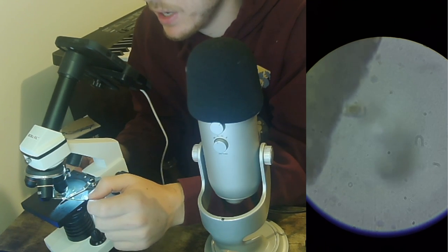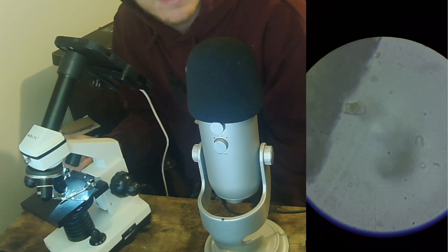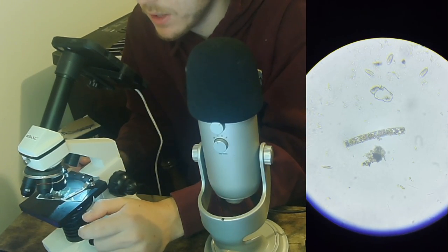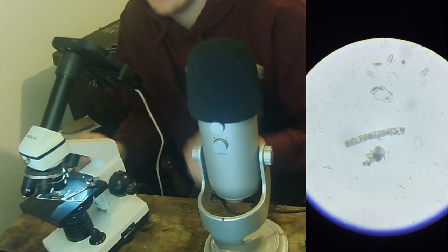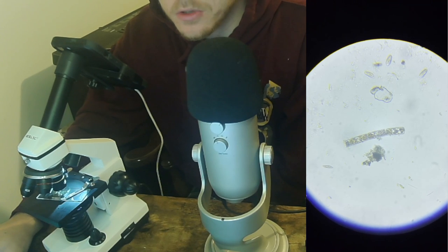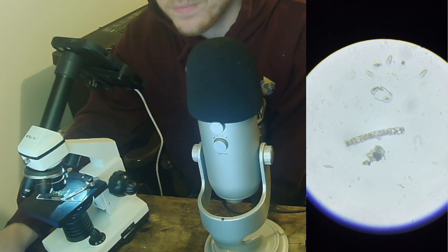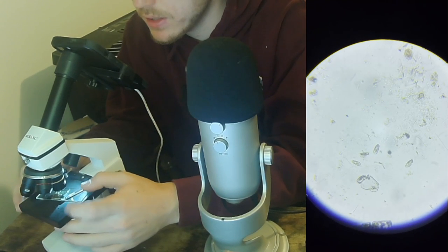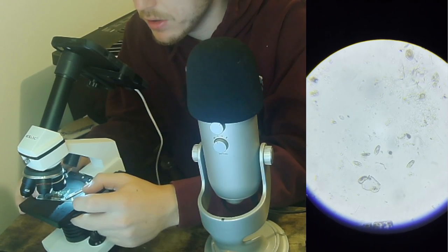So this guy is probably hard to make out but this is in the genus Roikosphania, which is a type of diatom. Very interesting, they have a very unique shape. I don't know how to describe it in an effective way but you can tell them apart pretty easily by their shape. I do believe that's what that is. I'm not a hundred percent sure, but that certainly looks like the images that I've seen before. It's a type of diatom, I believe.